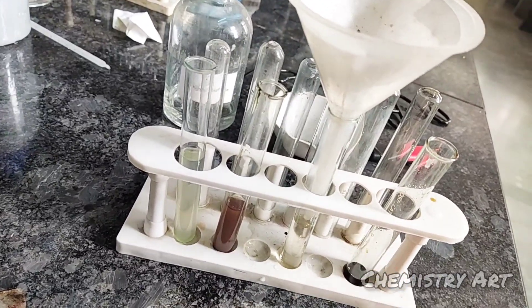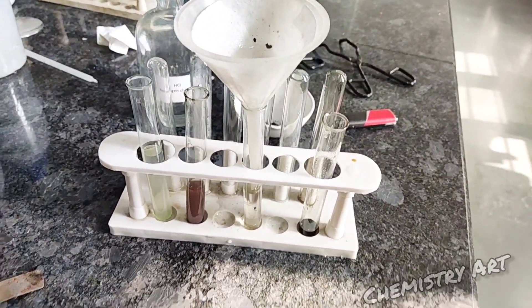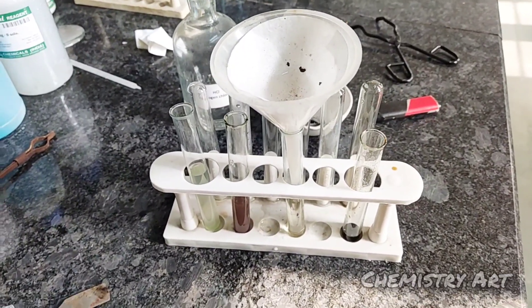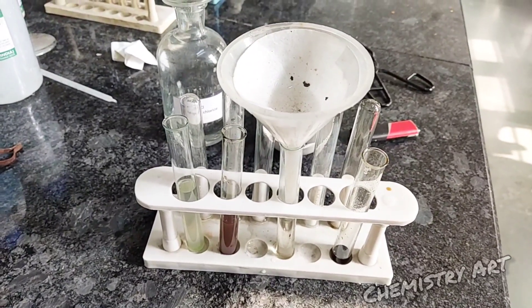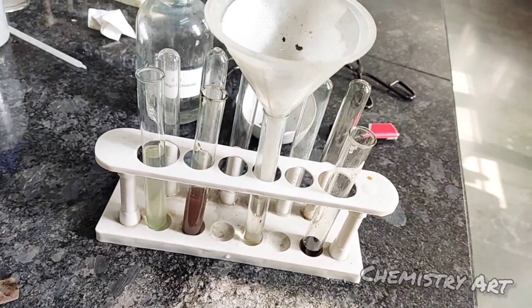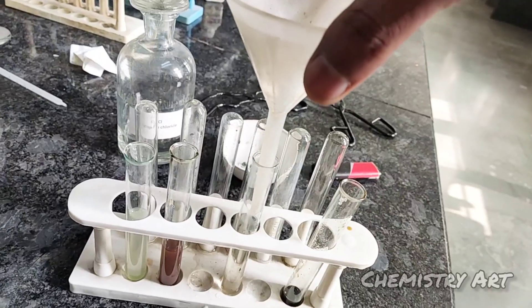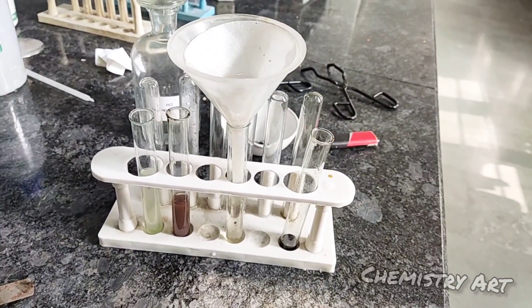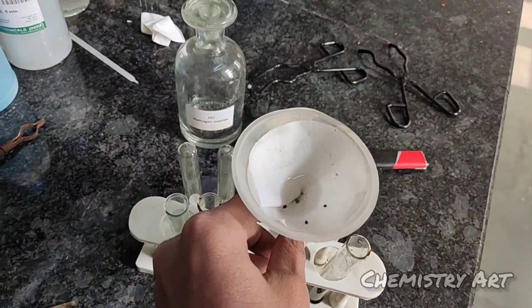One more thing: in an examination you will be given an unknown compound and you must perform all tests — nitrogen, halogen, and sulphur. Here I know that this organic compound contains nitrogen, so I will show only the test of nitrogen. The solution is now filtered and we are going to perform the test of nitrogen.